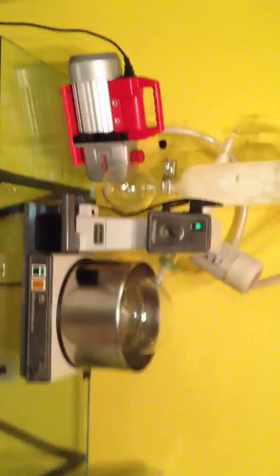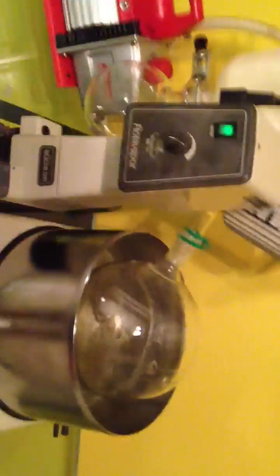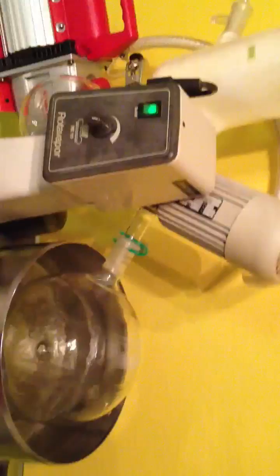You can see here there's a collection flask that has the water dripping into it — that's the distillate. So I'm going to be able to basically boil things without adding very much heat at all, keeping very natural raw flavors and producing a very powerful, very aromatic distillate. I'm very excited to share the Bucci Rotary Evaporator, and look for some exciting things coming from my kitchen in the near weeks.